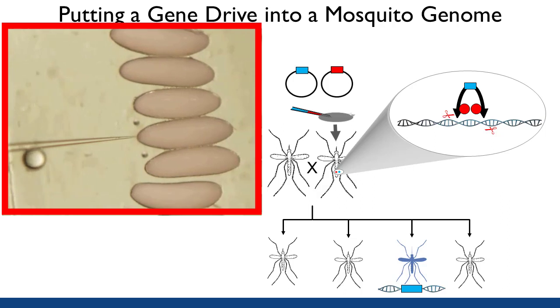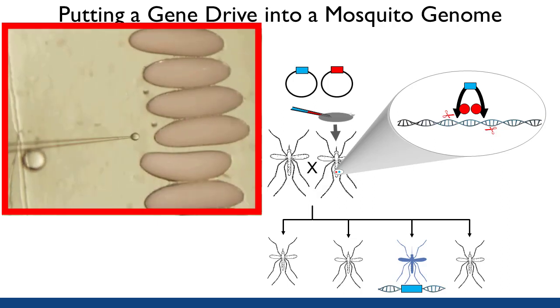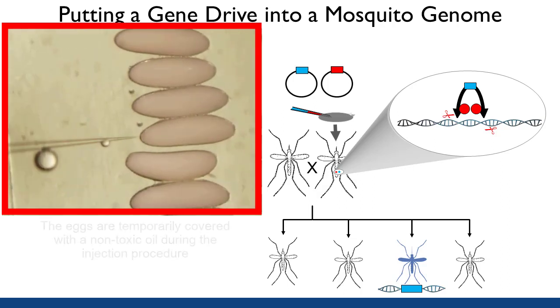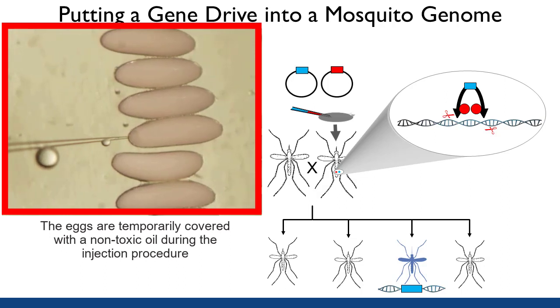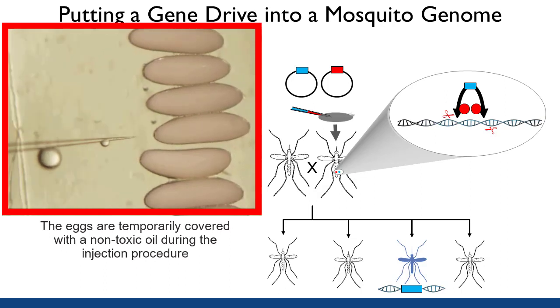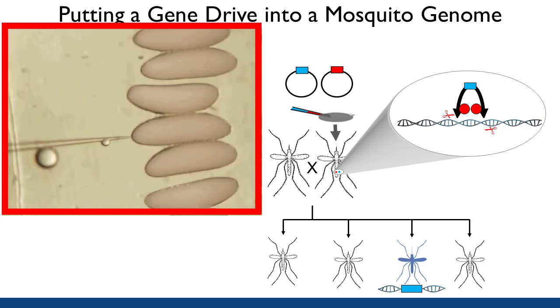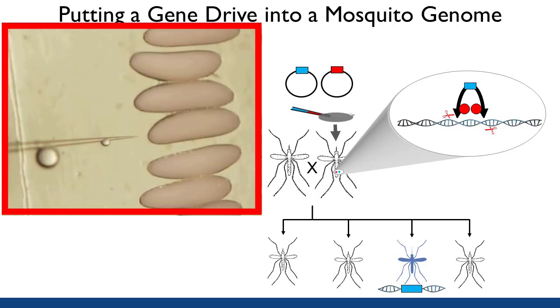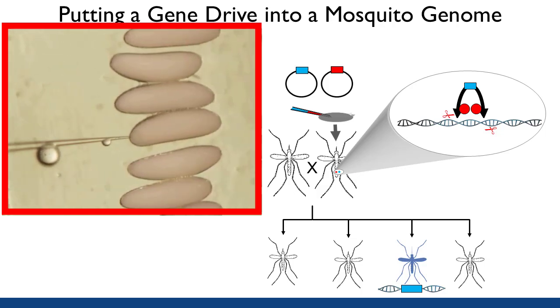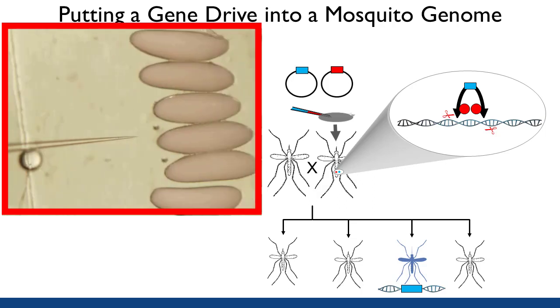In this case, the embryos are of the yellow fever mosquito, Aedes aegypti. These eggs have just been deposited by a female and are almost white and are fairly soft. They have been collected and carefully aligned in a row for convenience. In an hour or so, these eggs will be dark black, very rigid and hard, and impossible to inject. These eggs are about the size of a lowercase i on a typical printed page.